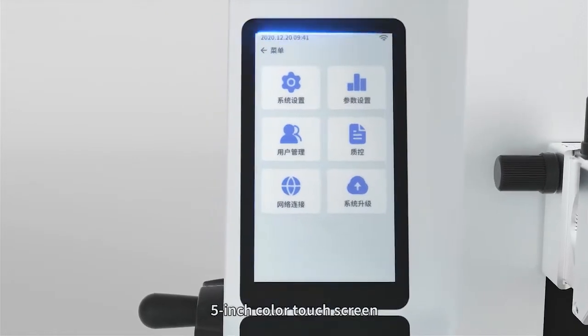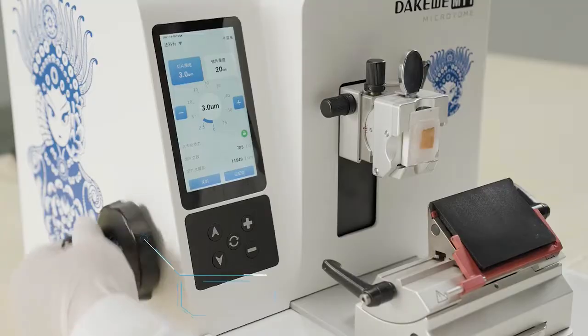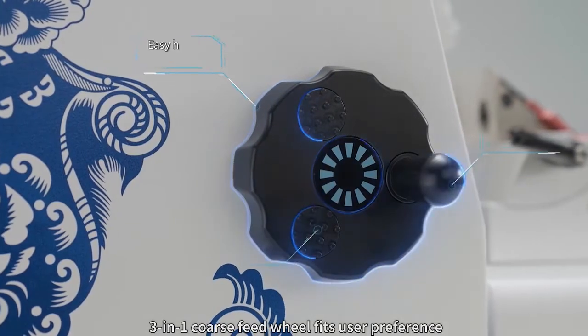A 5-inch color touch screen and control panel enable intuitive operation. The 3-in-1 coarse feed wheel fits user preference.